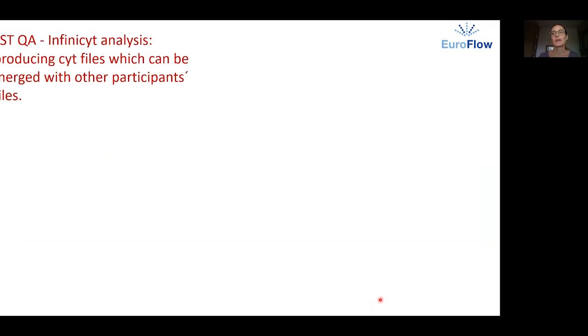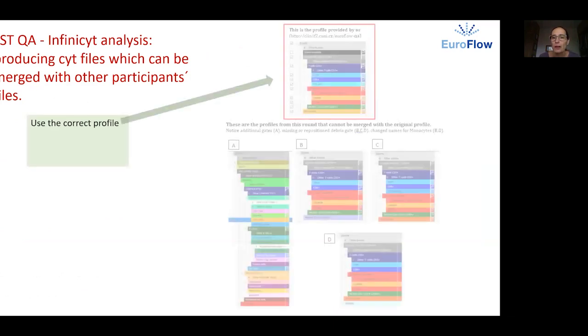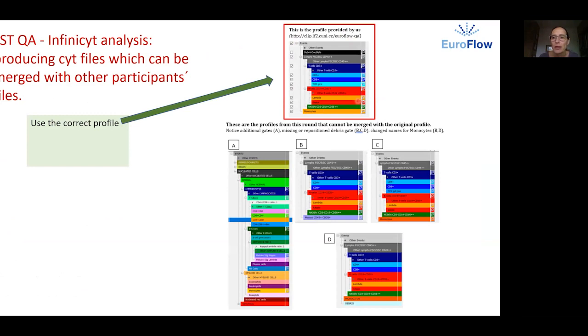Now I describe some common problems in LST reporting. In order to produce cyt files which we can merge with files from other participants it is important to use the correct profile here in red which is provided in the LSTQA instructions. These are the examples of incorrect profiles containing additional gates with missing or repositioned debris gate or renamed monocyte populations.